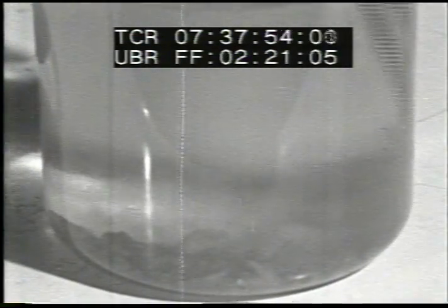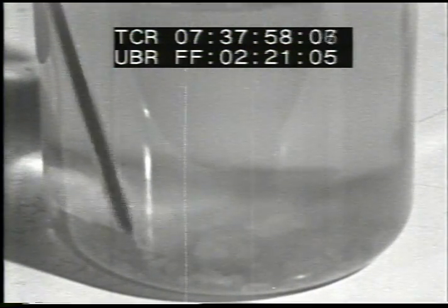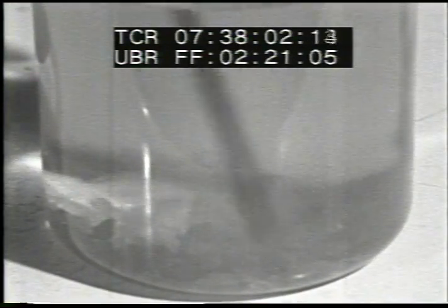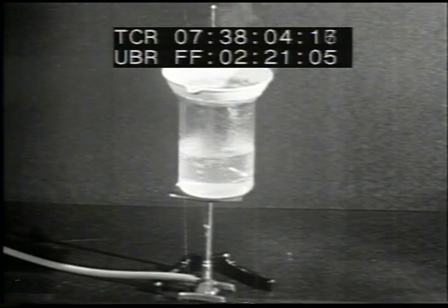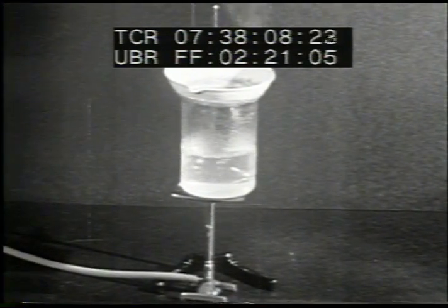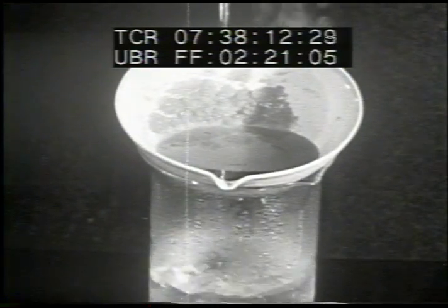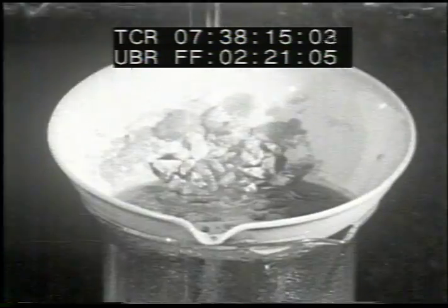Eventually, we reach a point where no more solute can be dissolved at that temperature. We now have a saturated solution. We evaporate part of the solvent, and almost immediately crystals of copper sulfate are precipitated from the solution. Here you see them forming on the sides of the container as the water is evaporated. If the evaporation takes place very slowly, the size of the crystals is increased.